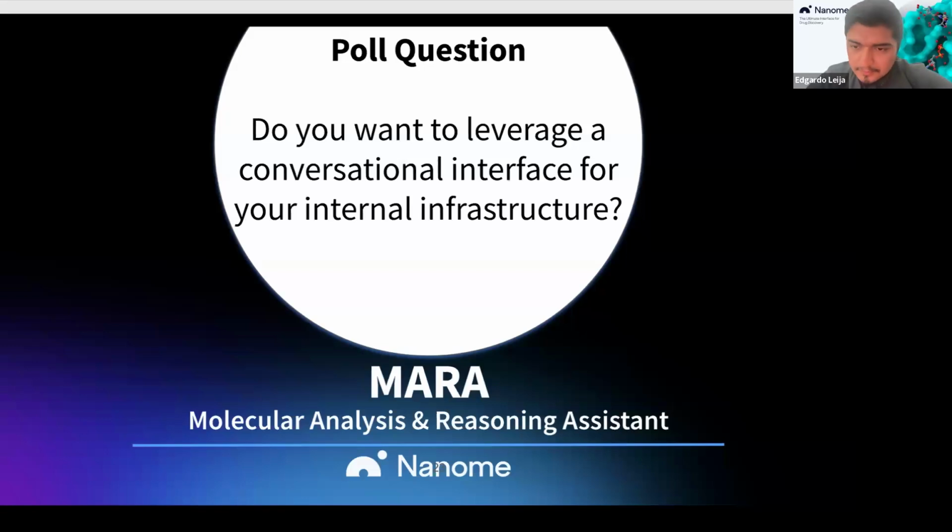Yeah, there were a couple other questions. How many actions are available with 50 credits? So every tool run is 1 credit, and workflows are typically 1 to 5 tool runs. So it depends what you're trying to achieve, but there is the ability to ask for more credits.